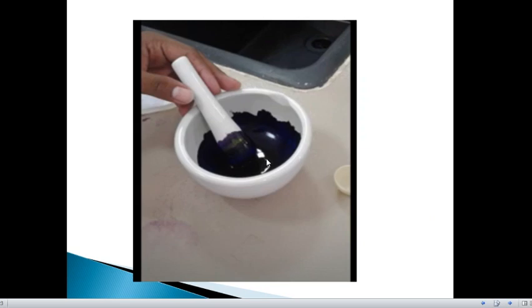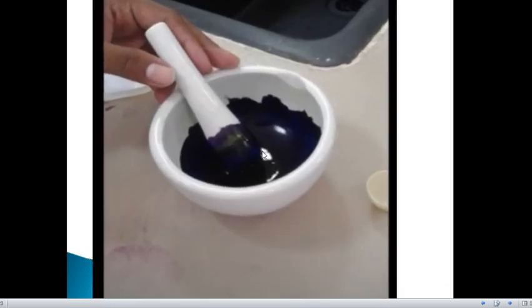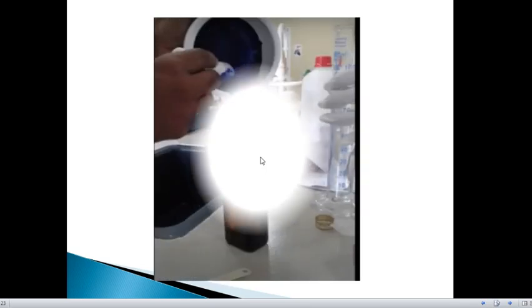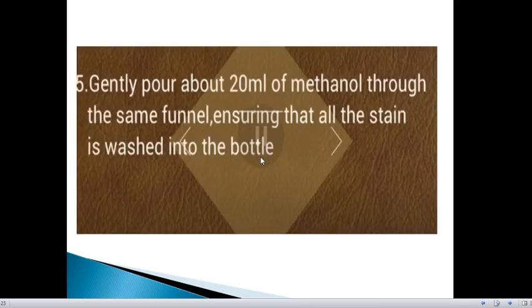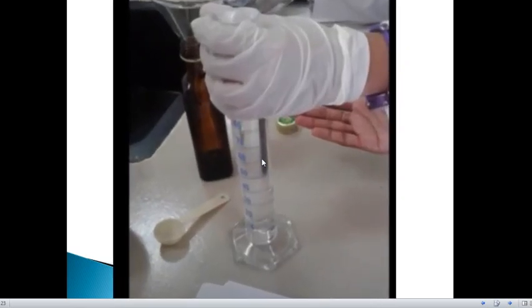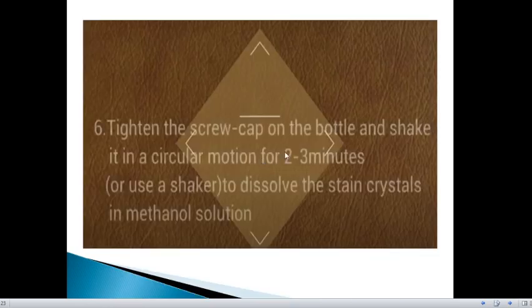This is how you mix the powdered solution. Next, put it into the dark or amber colored glass bottle through a funnel. After that, gently pour about 20 ml of methanol through the same funnel, ensuring that all the stain is washed into the bottle. Then tighten the screw cap on the bottle and shake in a circular motion for 2-3 minutes, or use a shaker to dissolve the stain crystals in the methanol solution.